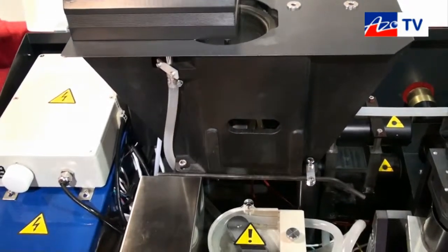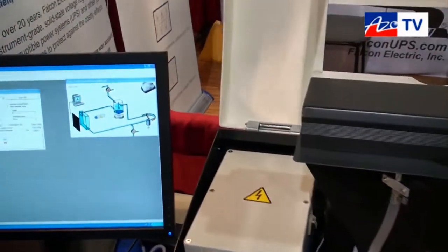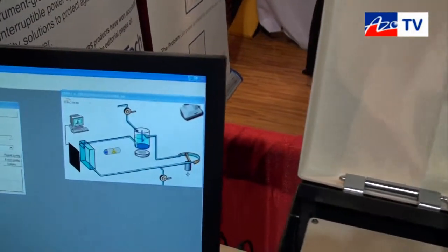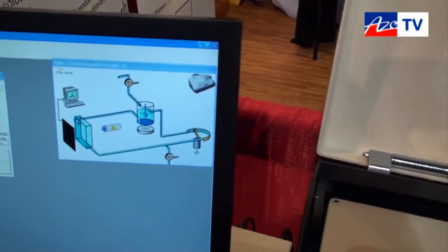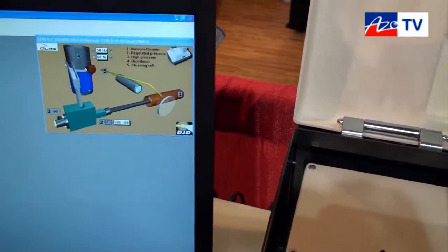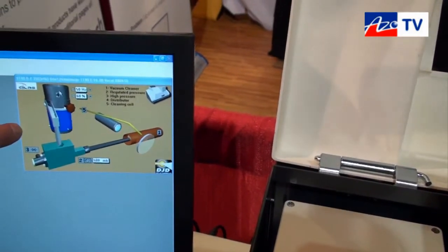If we want to simply switch to dry dispersion I'm going to show you in software first and then I will have you look at the hardware to see that there physically is no change. So to change from liquid to dry dispersion we have to hit one icon, so there is no physical change. We are now in dry dispersion mode.